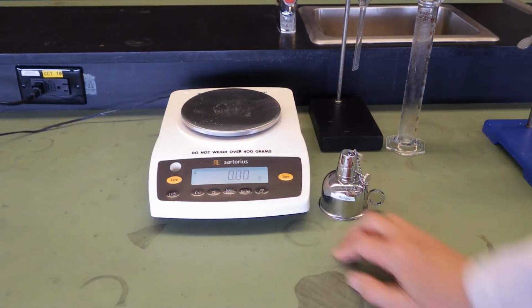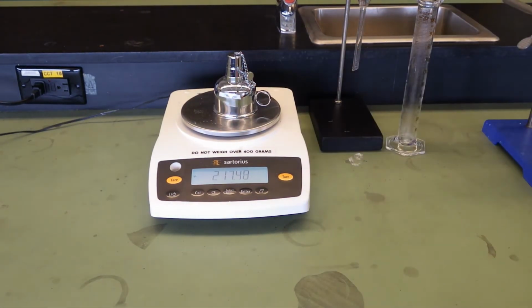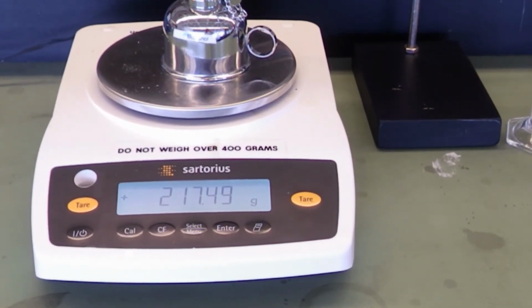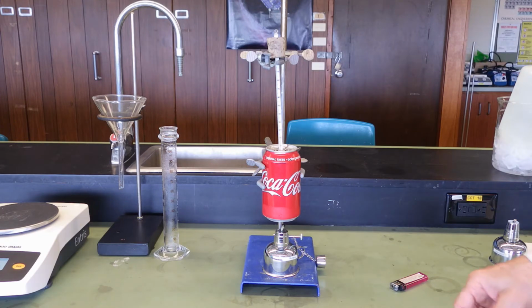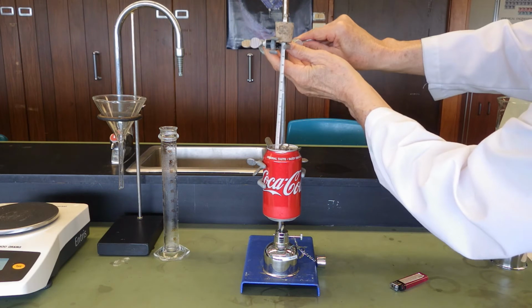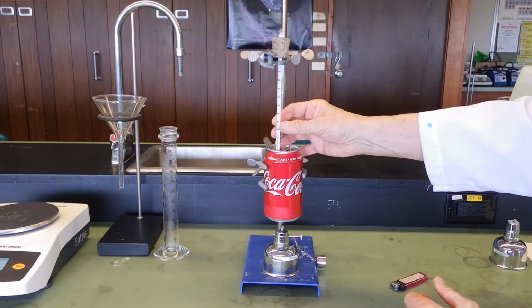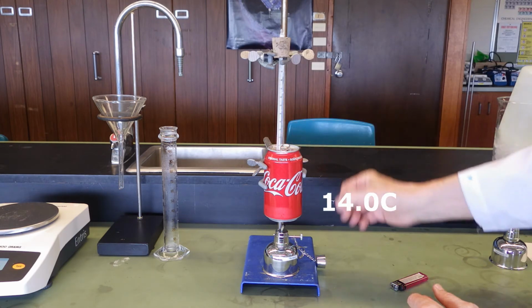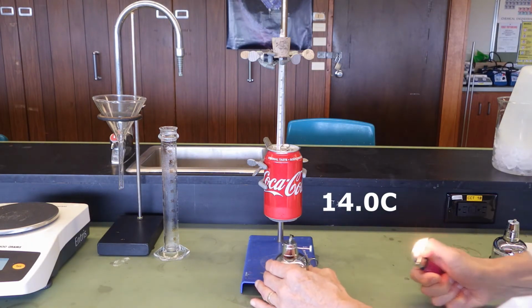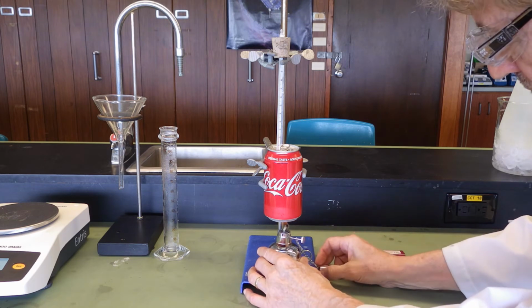Here's the methanol lamp. We'll get its initial mass: 217.49 grams. Okay, we're all set up. I've got the thermometer sitting just above the bottom of the can, suspended in the liquid. The initial temperature of the liquid is 14.0 degrees C. We've got the alcohol lamp just a couple of centimeters below the aluminum can.